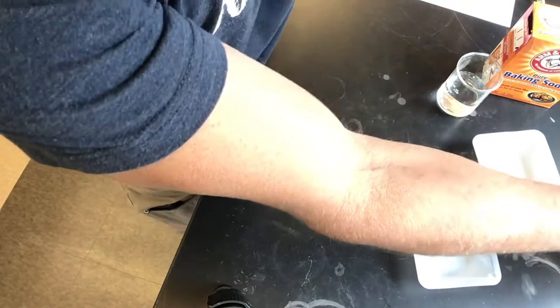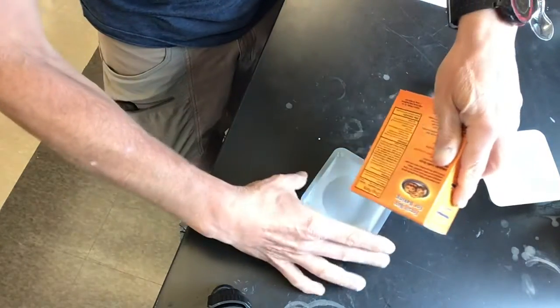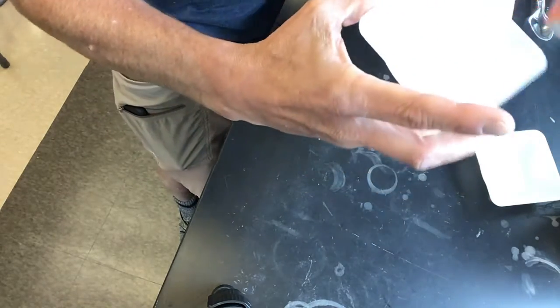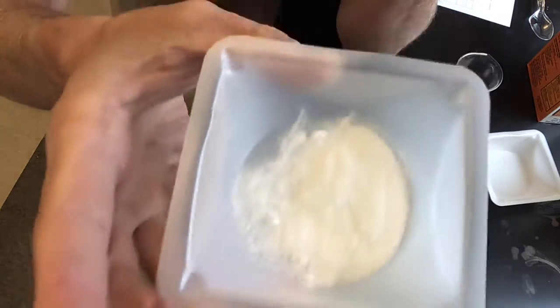The second chemical is the sodium bicarbonate, also known as baking soda. So there it is. This stuff is powdery. It's also white.